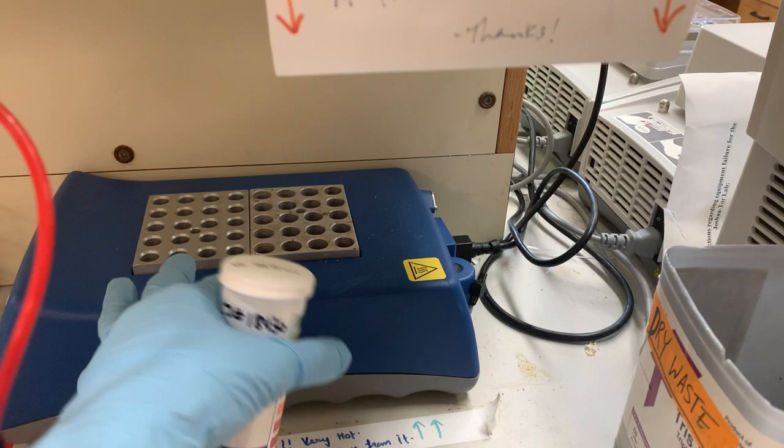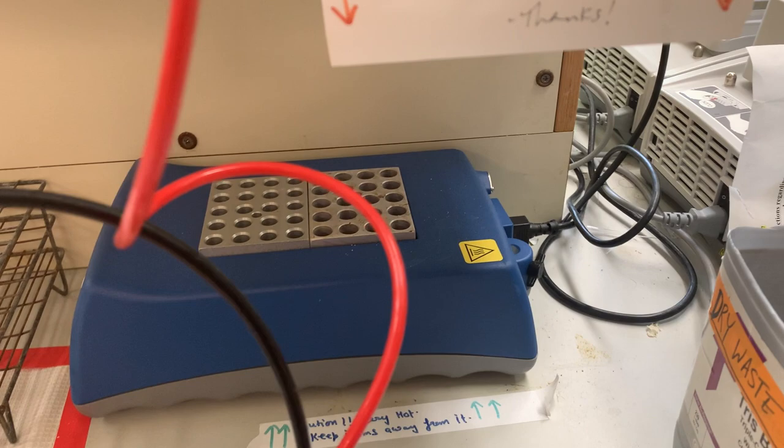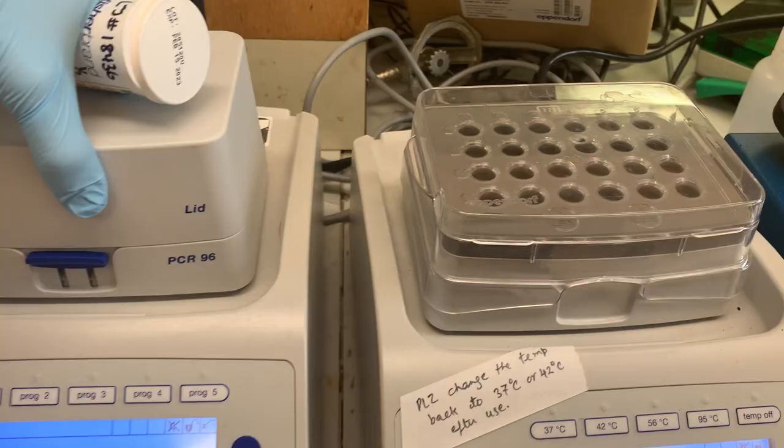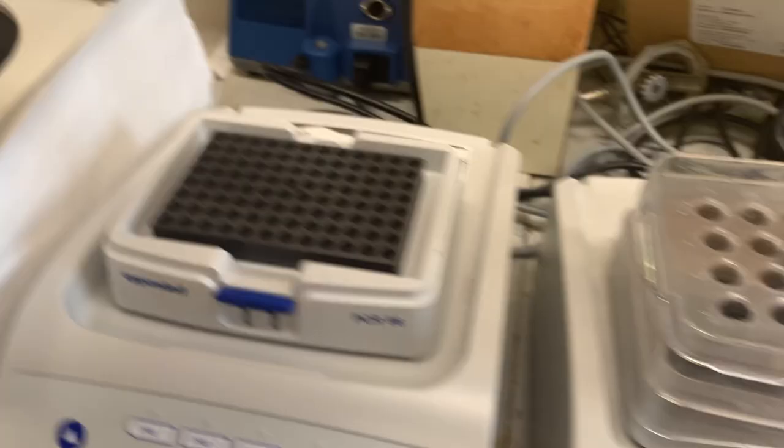We have a variety of heat blocks. This one is really convenient for preparing SDS-PAGE samples — you need to boil the sample first, and especially if your samples contain potassium, that's going to precipitate out with the SDS. So you want to take it straight from the heating block onto your gel. We typically leave these set at a single temperature. For more complex programs, we have incubators that can shake and accommodate different lid sizes — one has a PCR plate adapter. The simpler one still does the trick for small bacterial cultures like recovery after transformation.